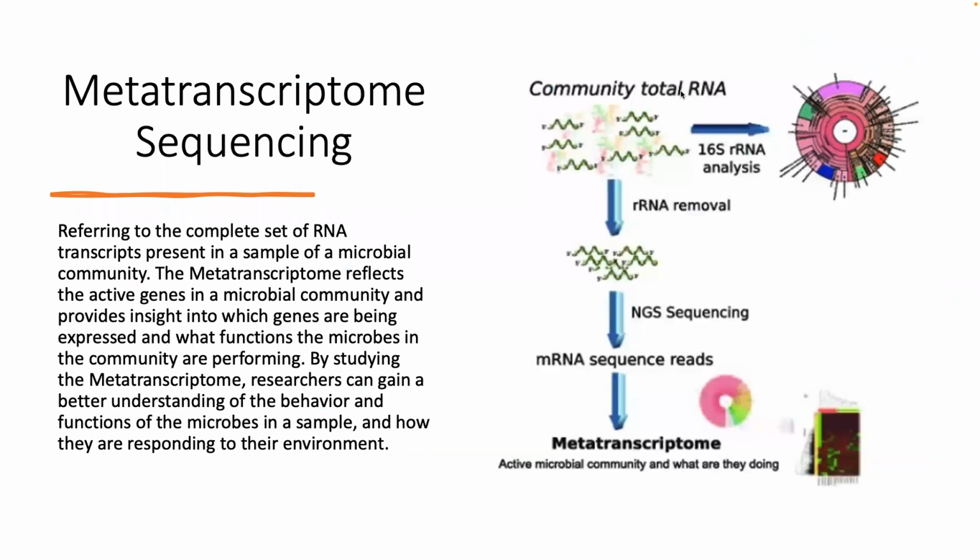All right, so let's just briefly talk about what metatranscriptome sequencing is. It refers to the complete set of RNA transcripts in the microbial community. It reflects the active genes of the microbial community, provides insight into the gene expression of microbial functions, and gives us an understanding of the behavior, if we can give bacteria that phrase, of the organisms. It shows how they're responding to the environments they're in.